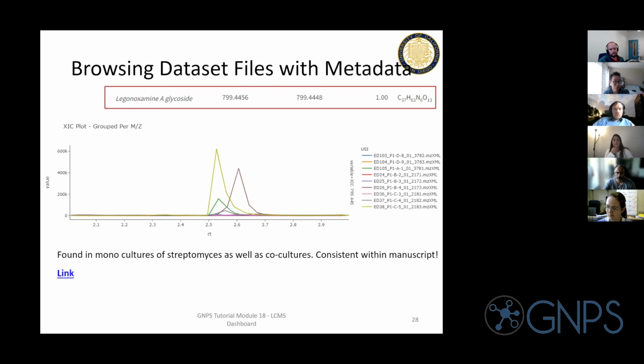So any questions so far? This is exploring public data. We're going to be moving on to how we can start sharing results and synchronously visualizing results with other people. Any questions? Don't be shy.